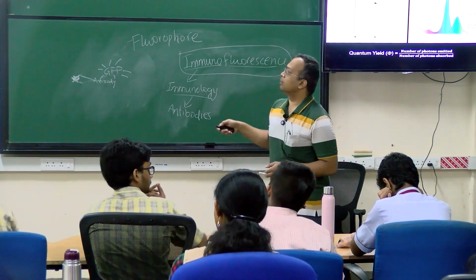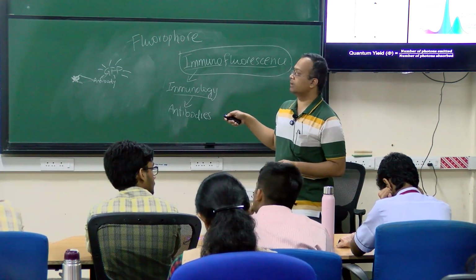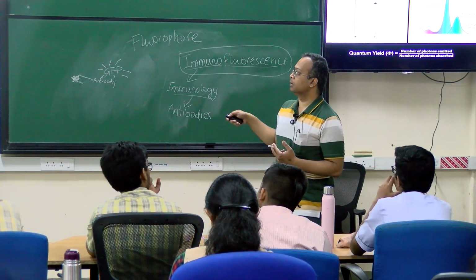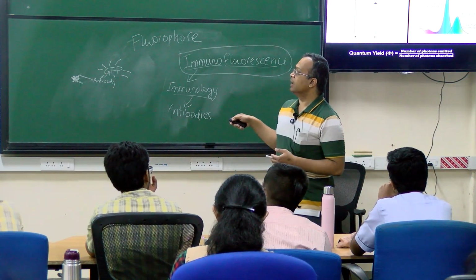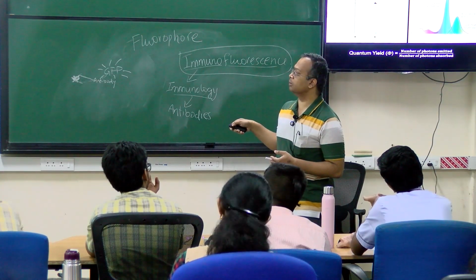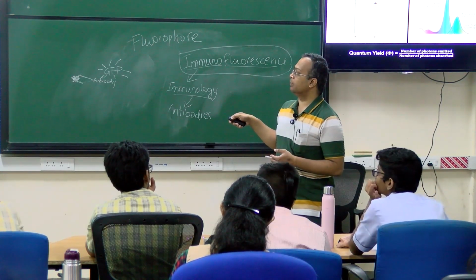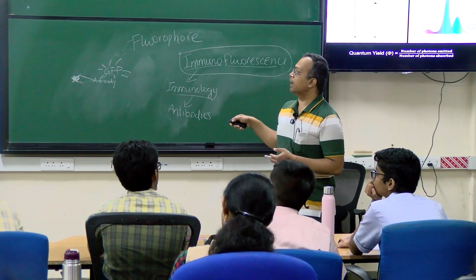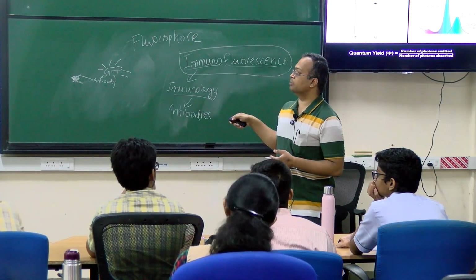When the electrons rise up to this excited state, there is some loss of energy due to some atomic effects, and the remaining light comes out. So let's say I shine blue light on this molecule. It will rise up to this level, lose some energy in the excited state, and then from the lower excited state fall down to the ground level. Because there was some loss of energy, the blue light that I shine comes out as green light.